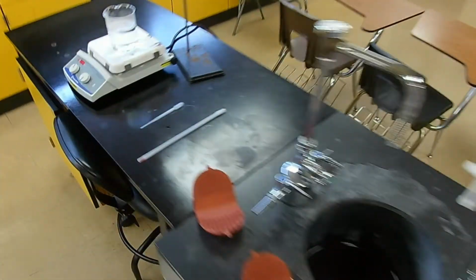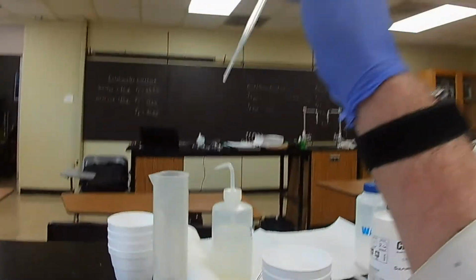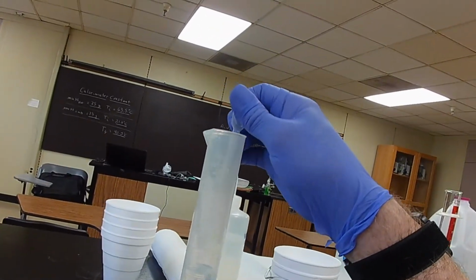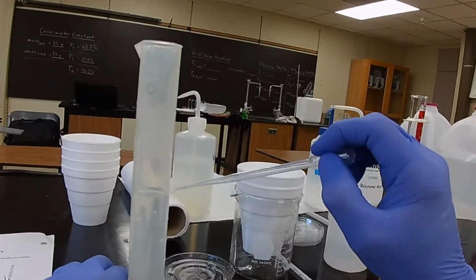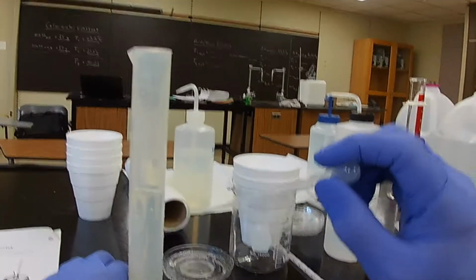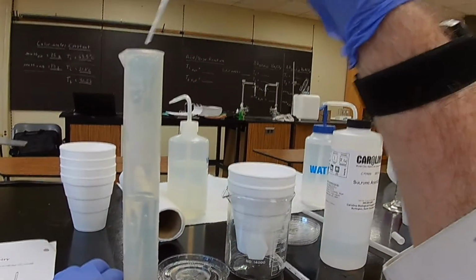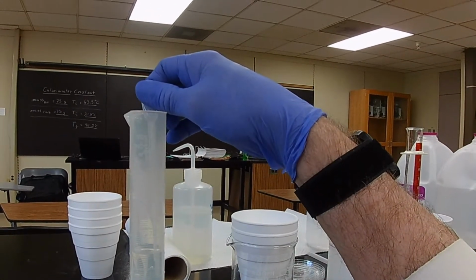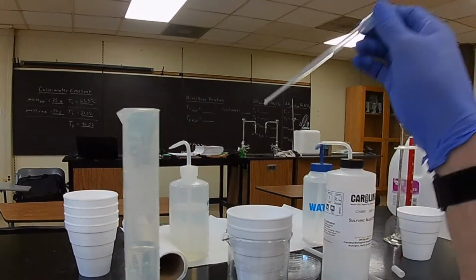So I'm going to use my pipette. This has only had water in it. And I'm going to remove enough to bring us down to 60. And remember, when you read these things, there's a line going all the way around. If you see 2 lines, you're not level. If you only see 1 line, your eyeballs are level. So we'll just take a little bit out of it to bring it down to 60.